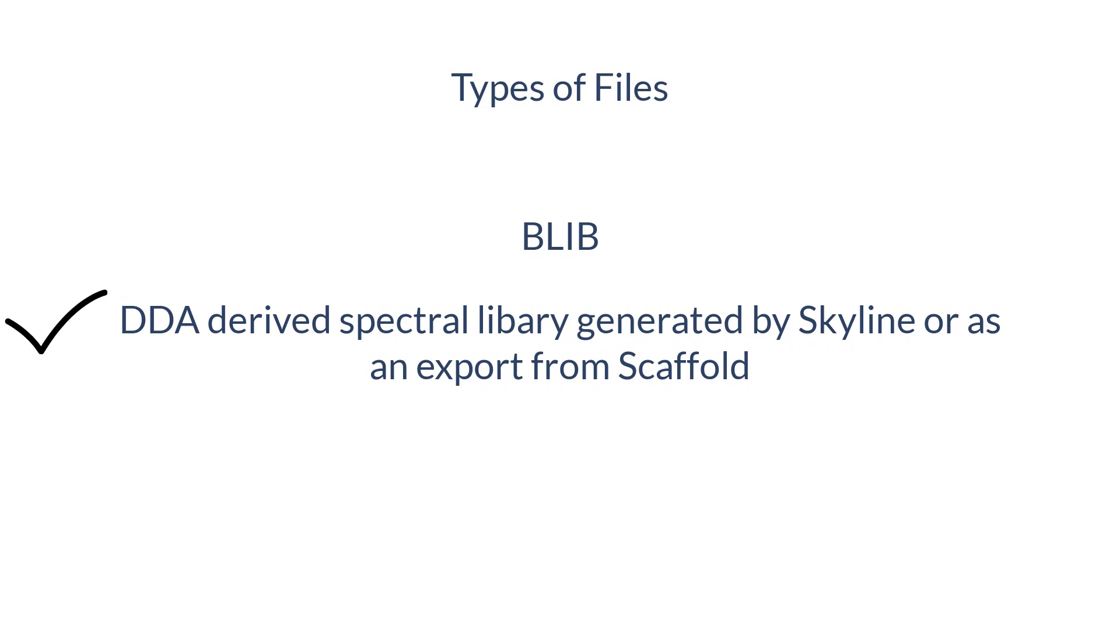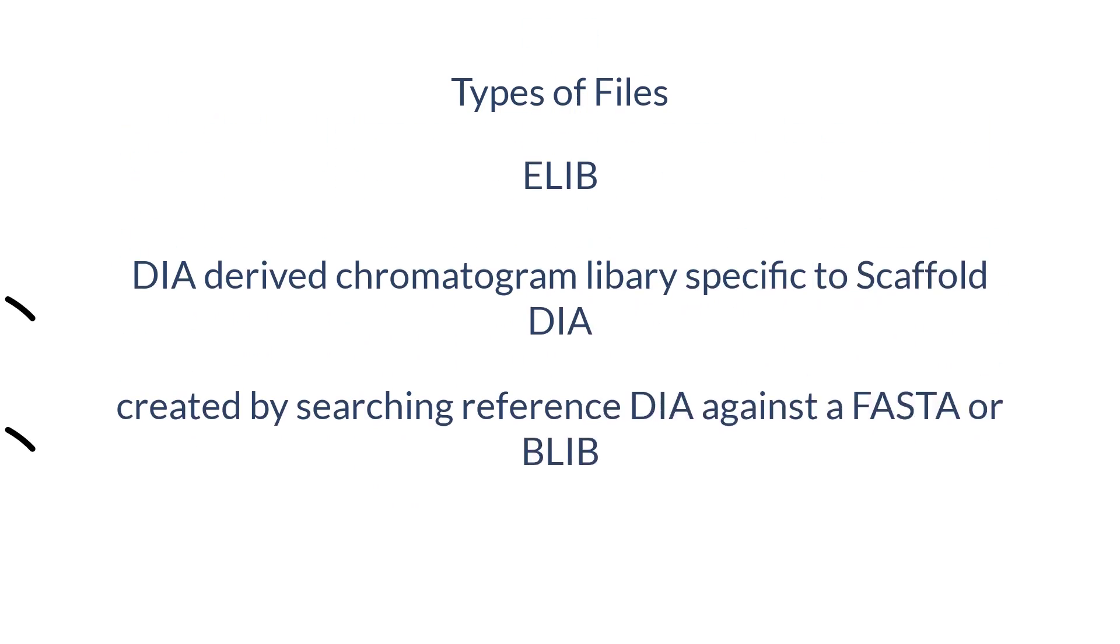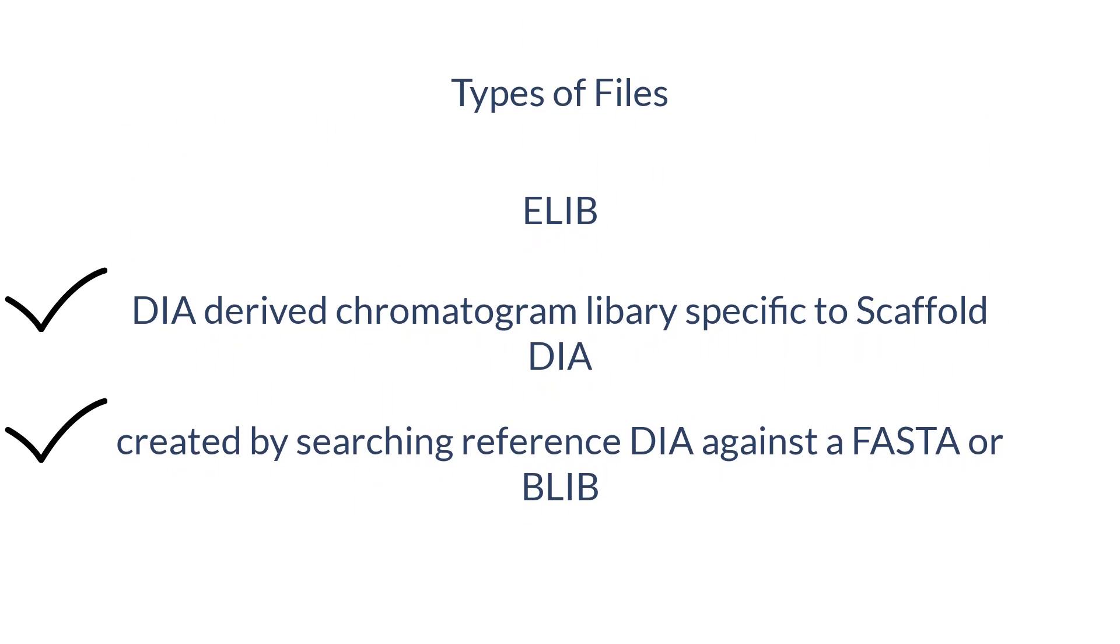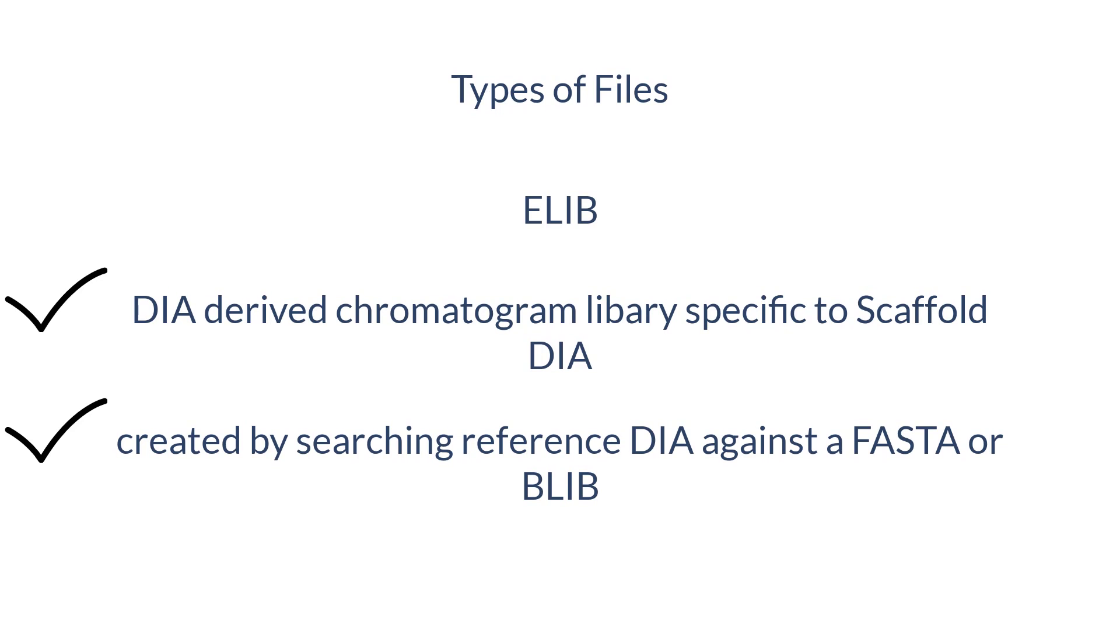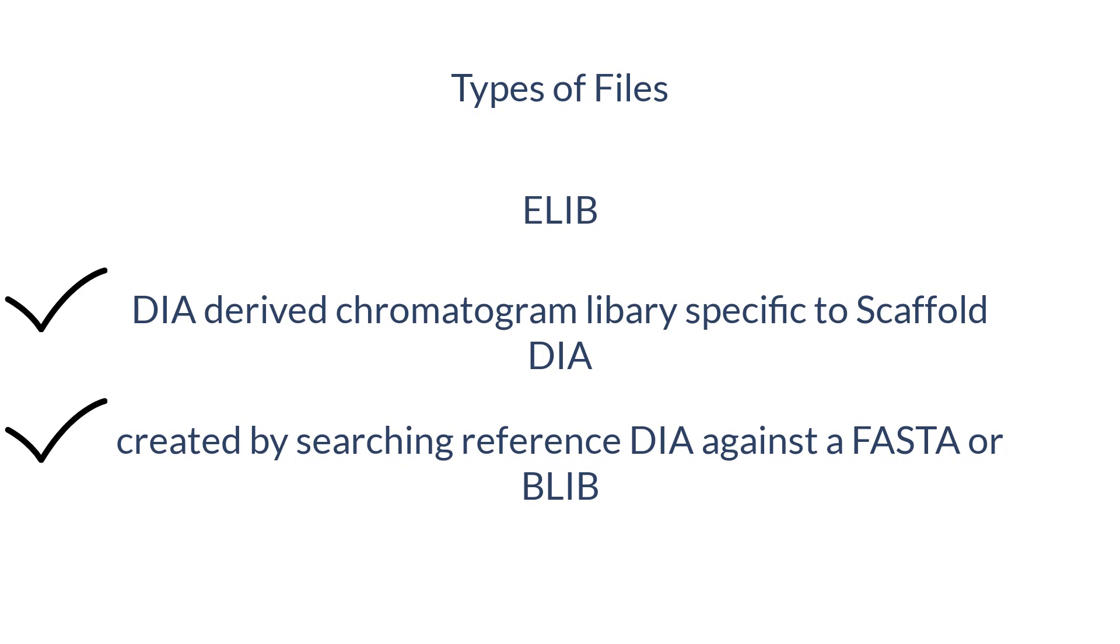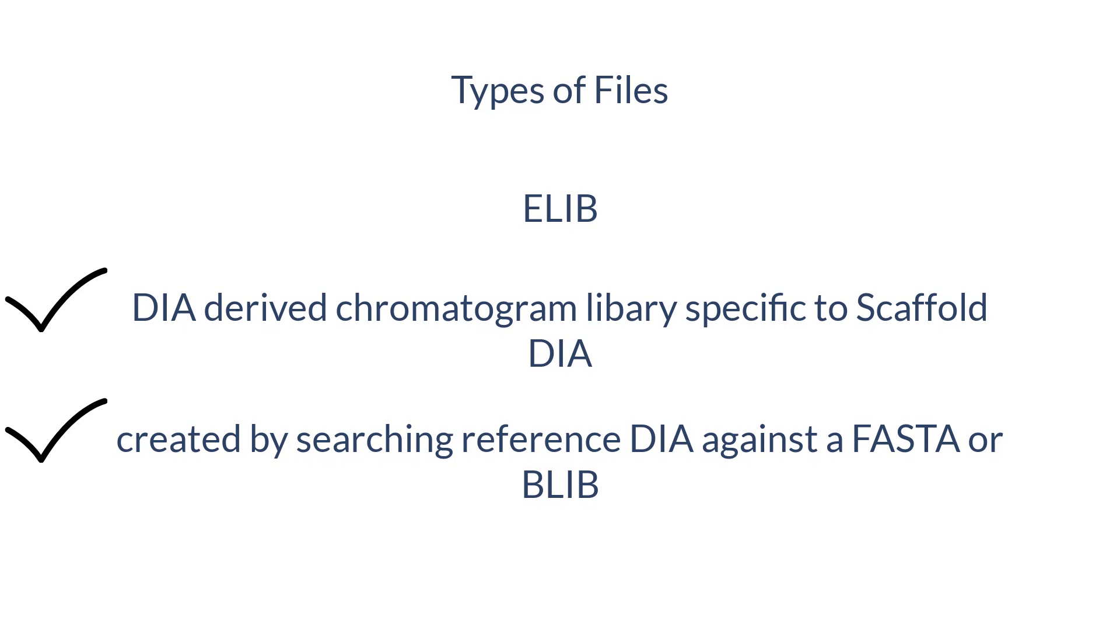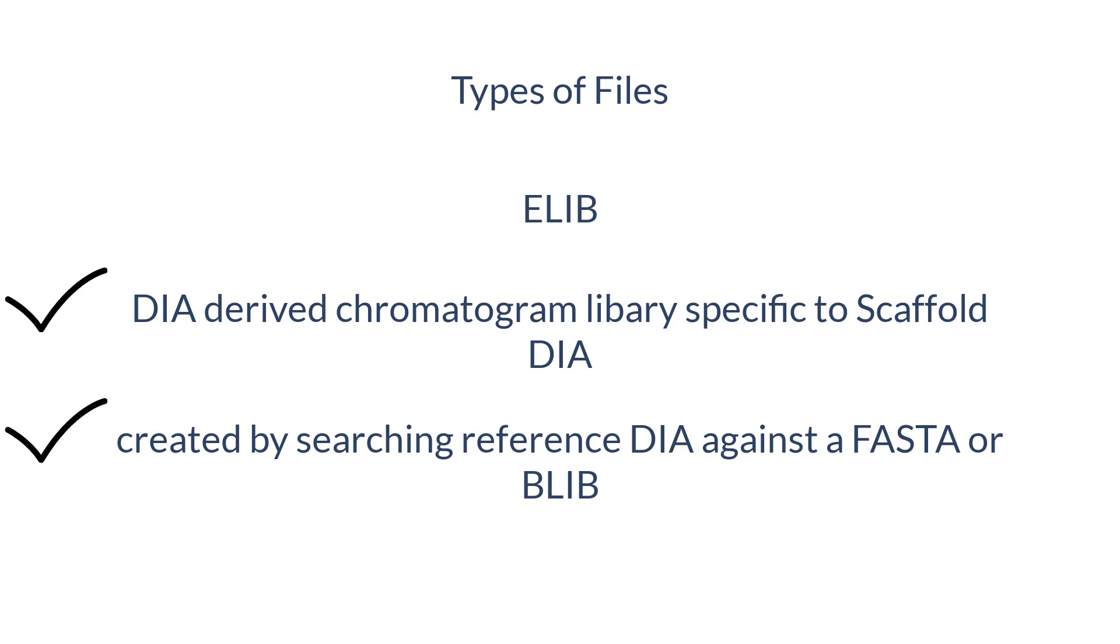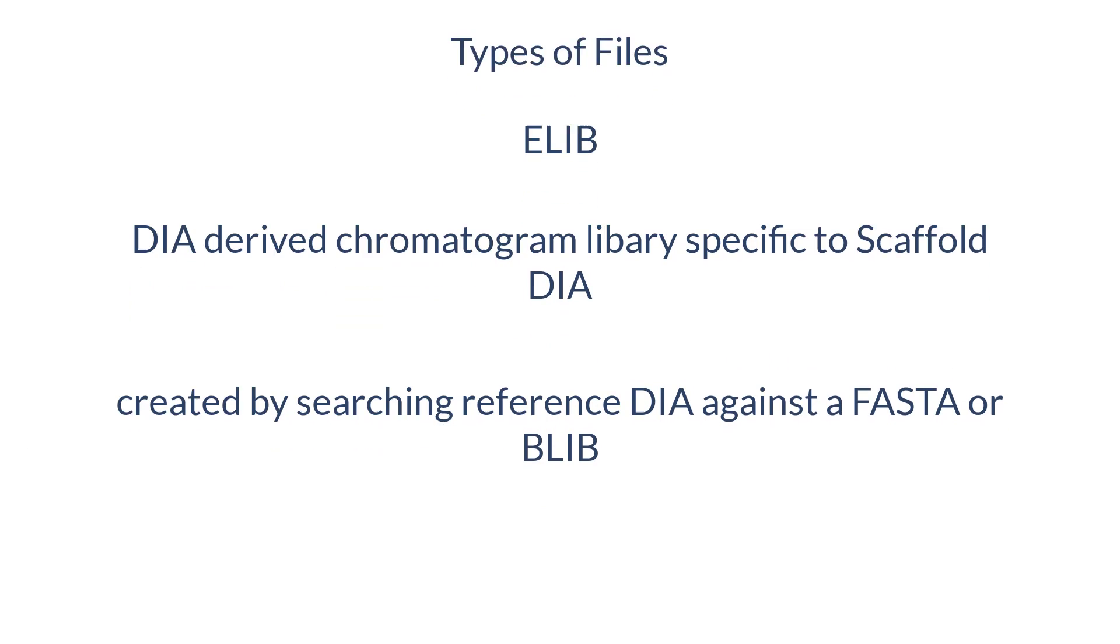Note, Blibs are derived from matching DDA data. Finally, data can be searched against an ELib. An ELib or Chromatogram library is a DIA library that is created by and specific to Scaffold DIA. Reference DIA data is searched against a FASTA or existing BLib to create an ELib. This file can then be used in additional searches.